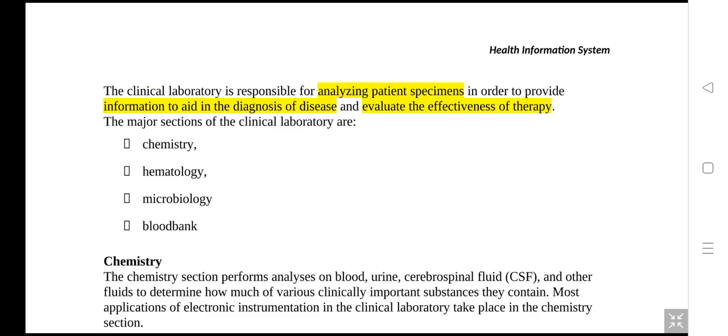If it's the stomach and you are dealing with stool, all those gadgets for taking stool are in the lab. I've left out extraction, which is very important when defining the lab. I think we're in agreement.